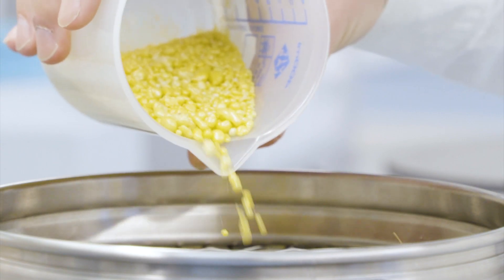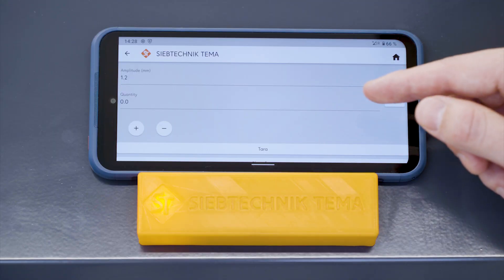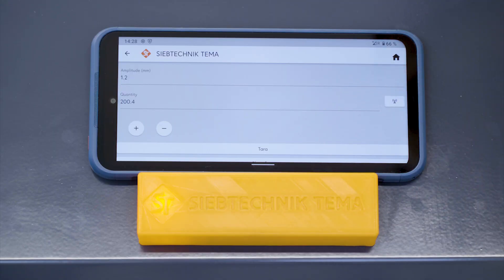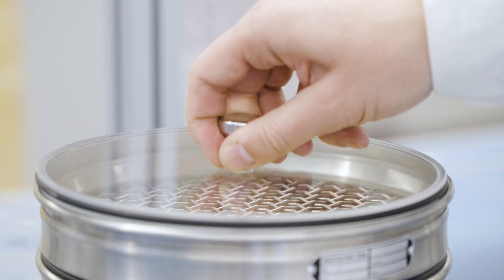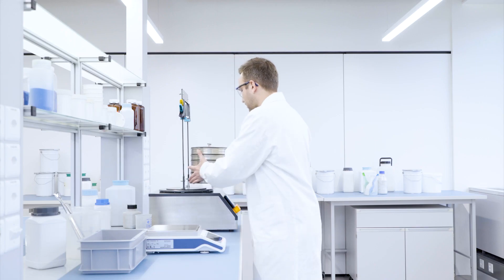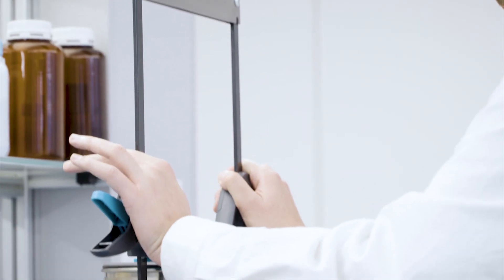Now you can weigh your sample. Proceed with sieving your sample — simply fix the sieve tower on the ASM with the quick-release fasteners.